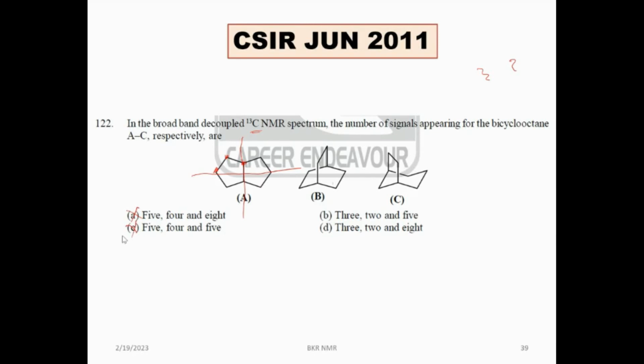Second molecule totally symmetrical. I can have a C3 axis of symmetry. அப்படியே rotate பண்ணிடலாம். அப்படியே I can rotate. So I can cut the molecule into half. இது இப்படி வெட்ட முடியும், இது rotate பண்ண முடியும். So இந்த ஒரு wing இன்னொரு wing எல்லாமே சேம். எல்லா விங்குமே சேம் தான். அதே wingல இந்த கார்பன் சேம்.